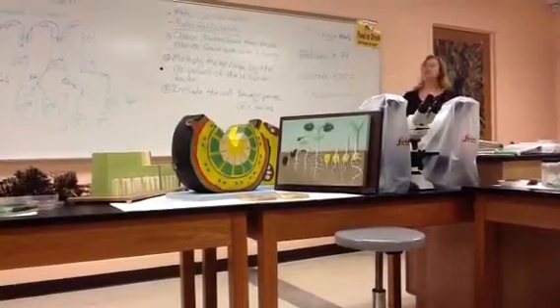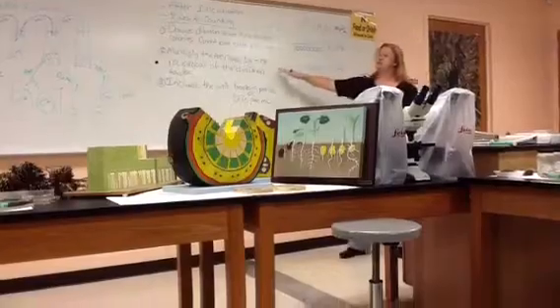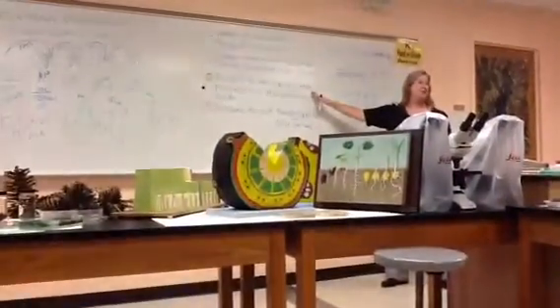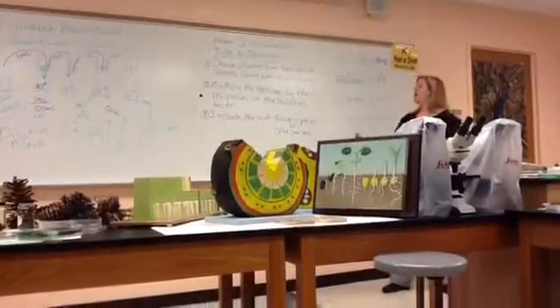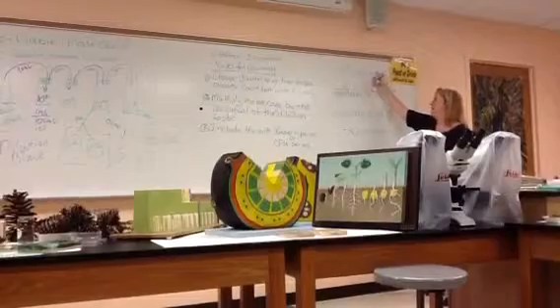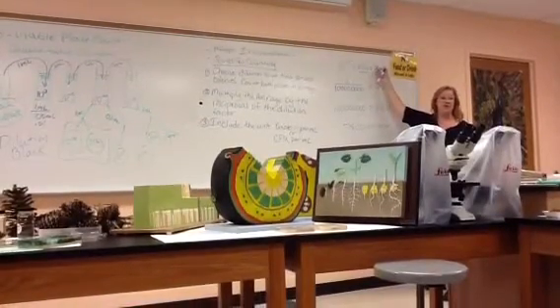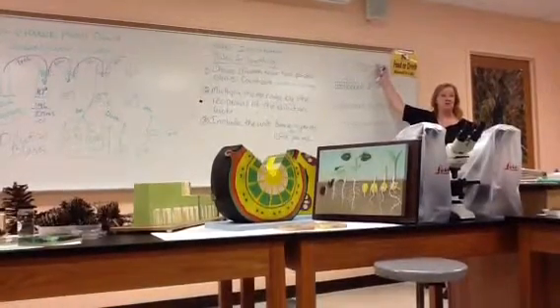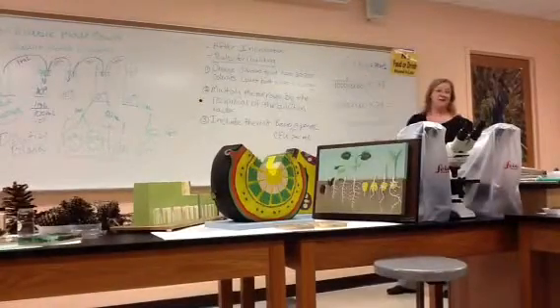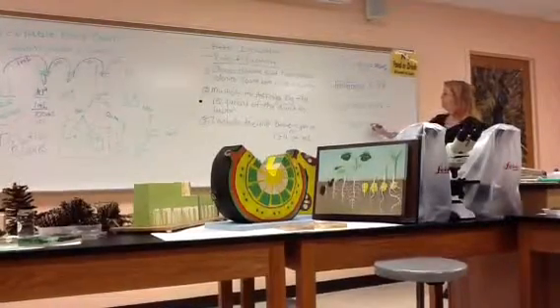So you honestly don't have to remember step 2 to do the math. I mean, you have to know step 2 in case I ask you about it on a quiz. But whatever the dilution factor is, that's how many zeros you add to the end of the average. That's all the math we're doing here. Whatever you count, you add that many zeros to the end and you get the answer. Okay. See, not so bad.